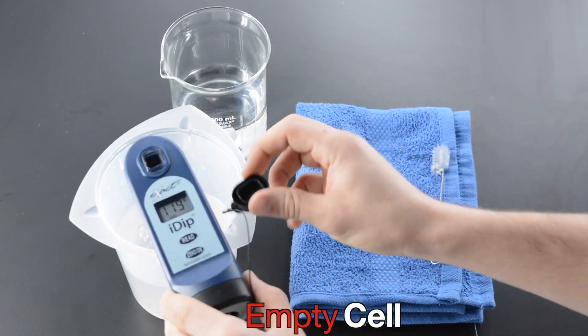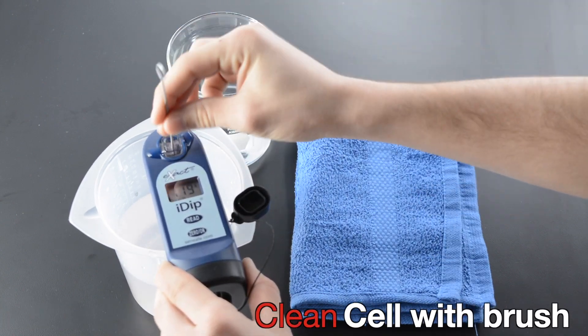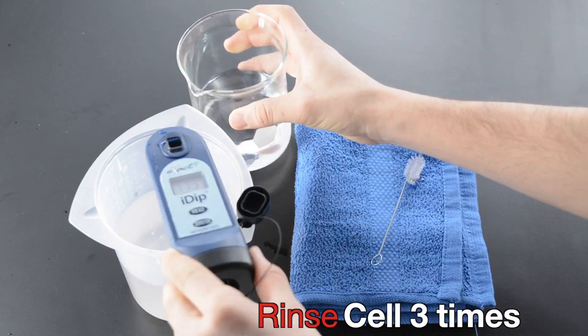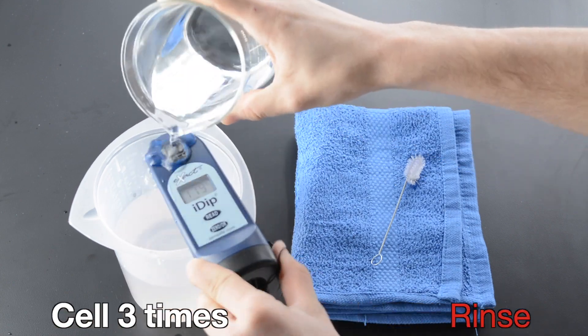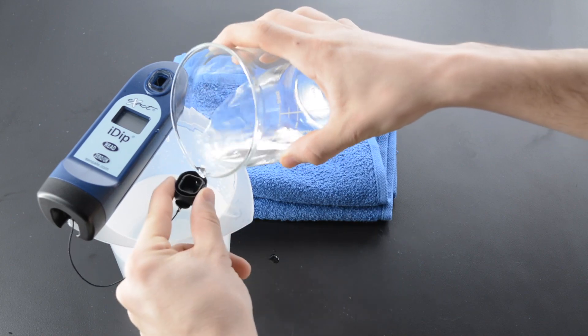Empty cell. Clean cell with brush. Rinse cell three times. Rinse cap three times. Preview.